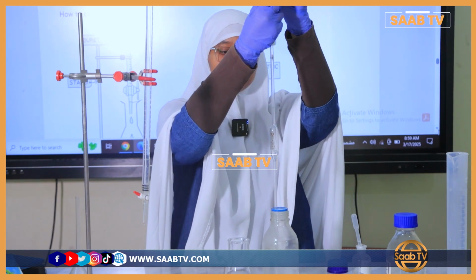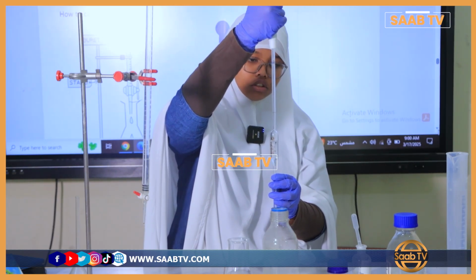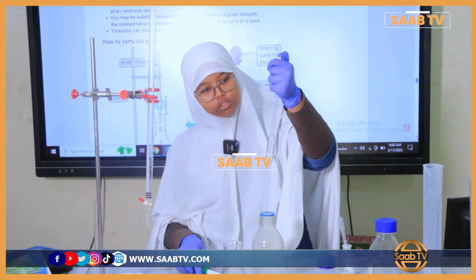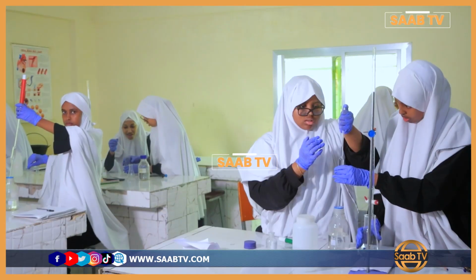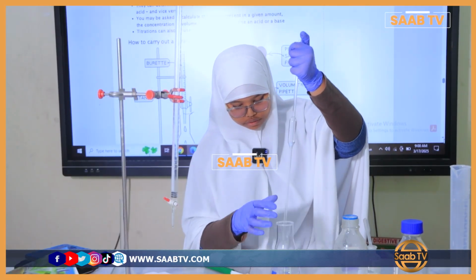And then you add extra so you can get the exact amount you need. Then you remove it and use your thumb to get the exact amount you need. In this right here we have a conical flask, so we put the alkali inside.